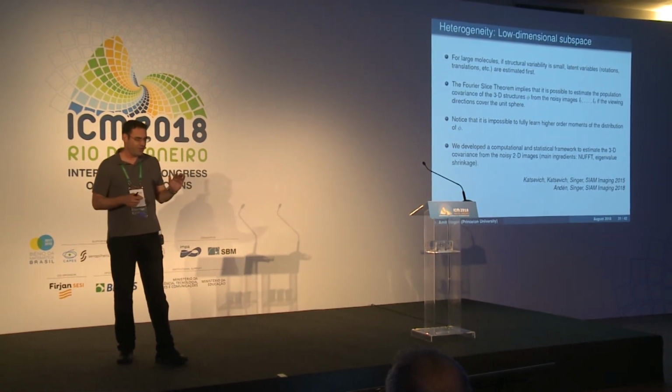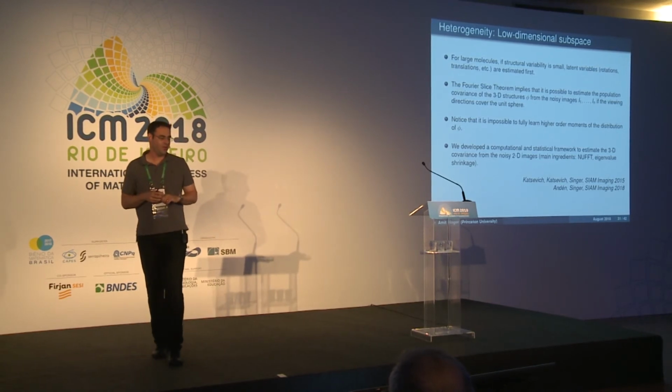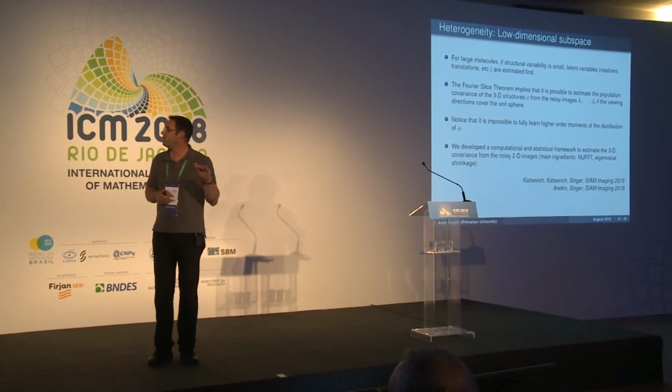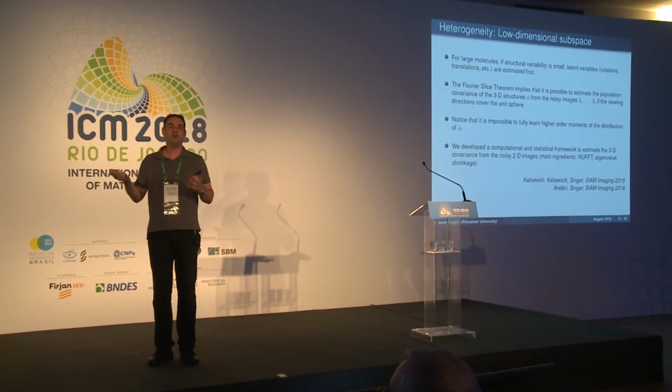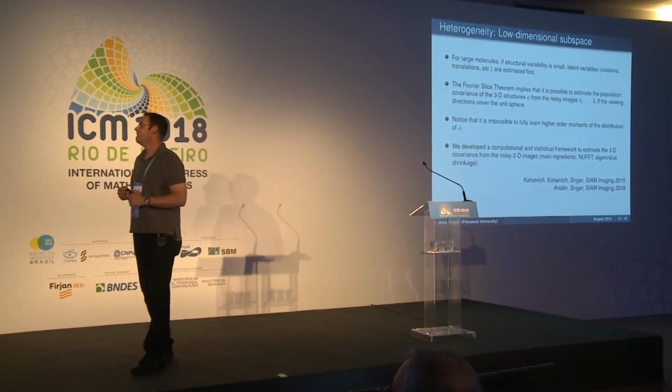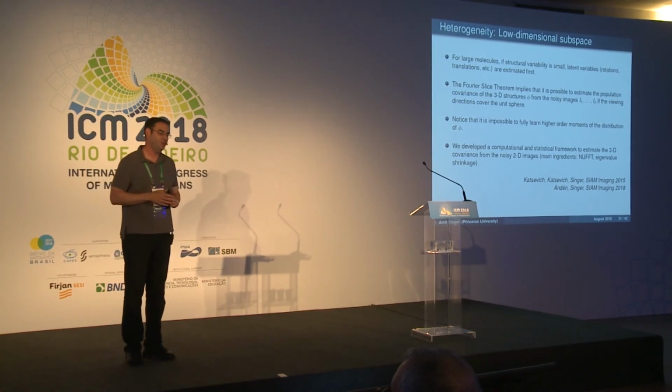For the sake of time, maybe I'll skip that, but if you want to discuss with me how to do it, I can explain. It's a much more ill-posed problem, where now you really need coverage of the entire viewing directions, unlike just 3D reconstruction, where you don't need that.